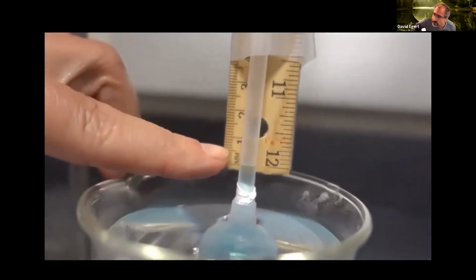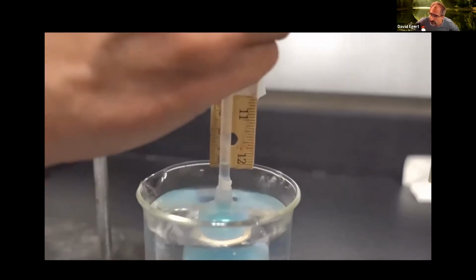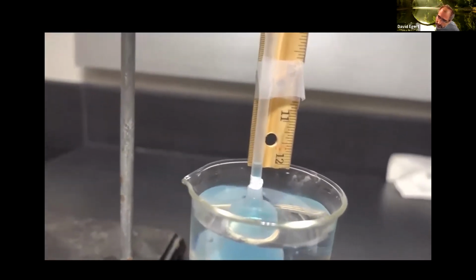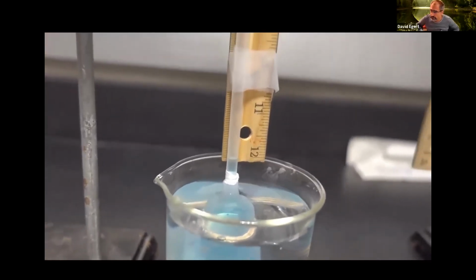And as it goes up the tube, I can just see directly off of here. In fact, I probably want to push it over a little bit because then it's even easier to see against the millimeters.